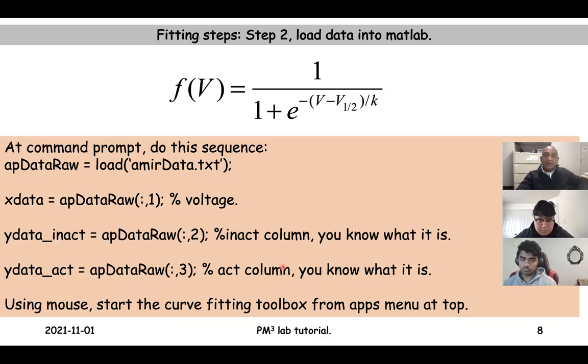You might import your data into MATLAB using the command prompt, using these 3 or 4 lines of simple code. Once you have loaded your data into MATLAB, you should then start the curve fitting toolbox from the apps menu at the top. That was the summary of step number 2.